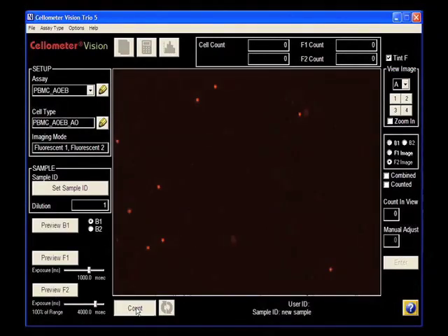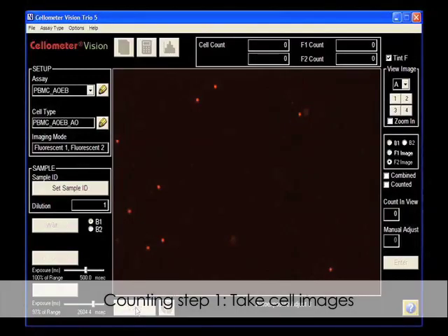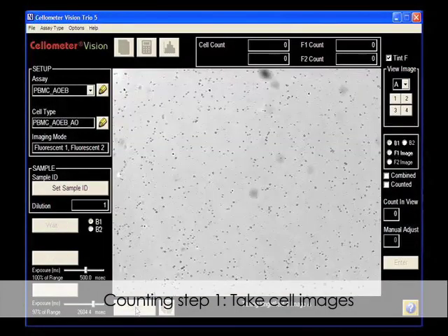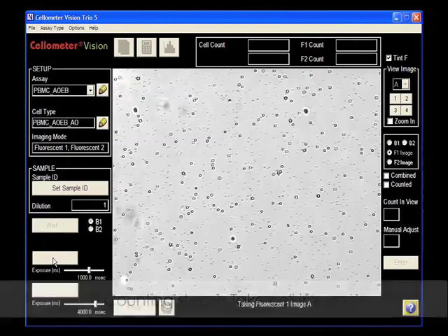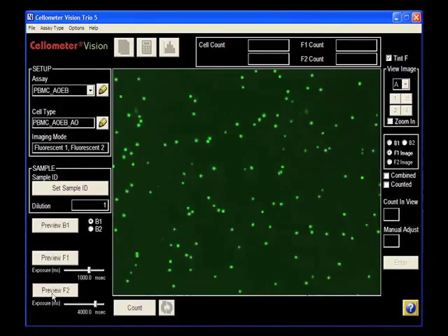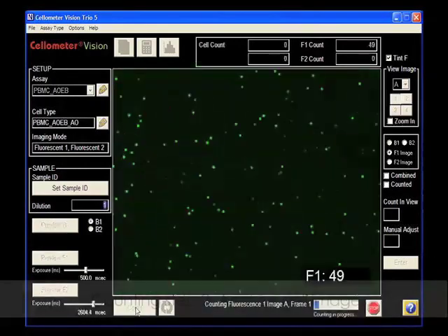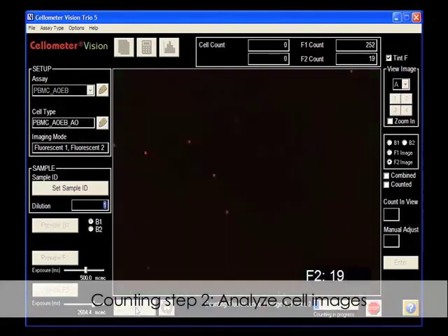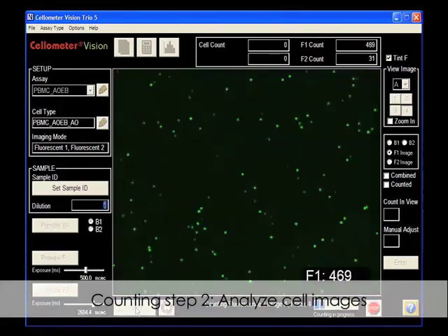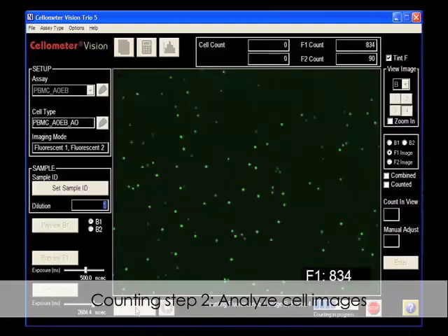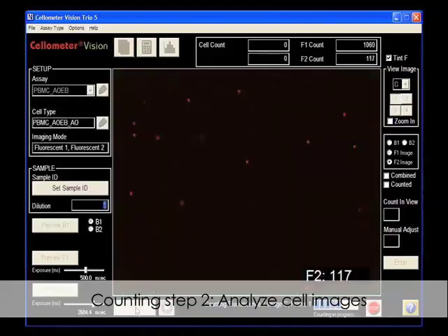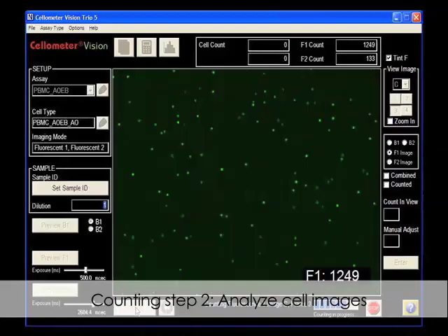Click count to automatically start cell counting. Cellometer Vision takes cell images in bright field and in fluorescence. Cell images are automatically analyzed based on preset parameters for live and dead nucleated cells.